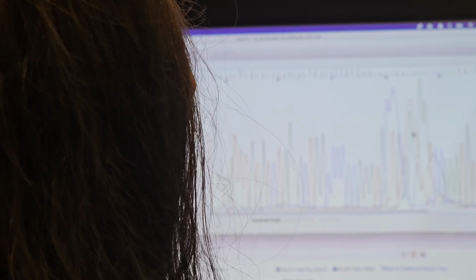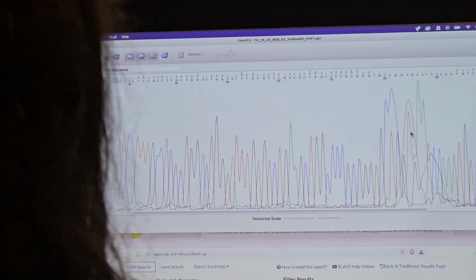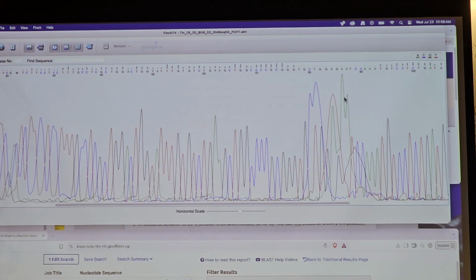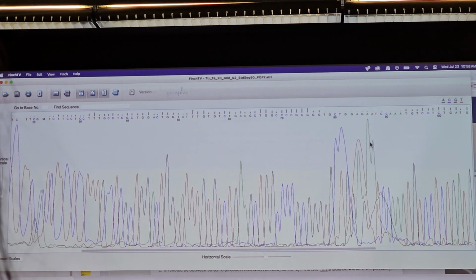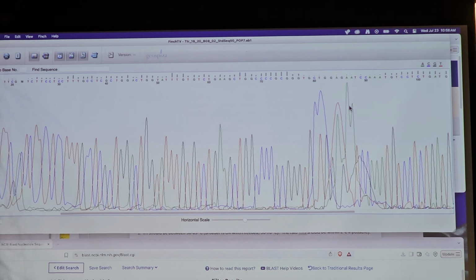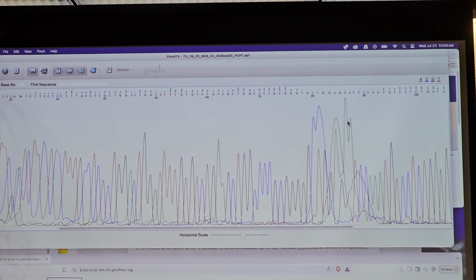And if you've got a nucleotide mismatch or a place where the instrument couldn't make the call and it put N, then it would most likely be in this region here. There were also some K's and R's in there. If it can't decide if it's an A or a G, then it puts R. If it can't decide if it's a C or a T, it puts Y, I believe. I think K is when it can't decide between G and T. Anyway, the different letters are when it can't make a decision, can't make the call.